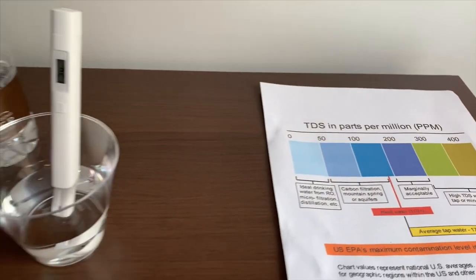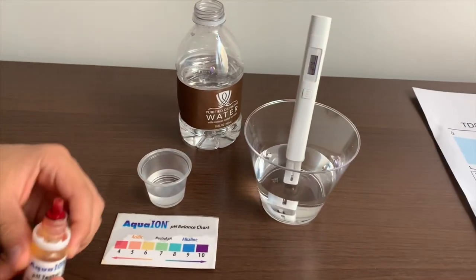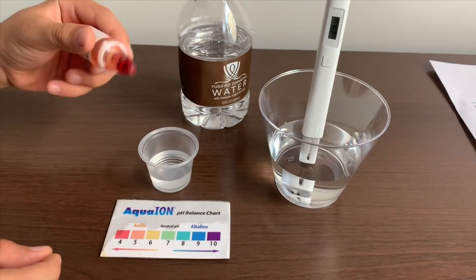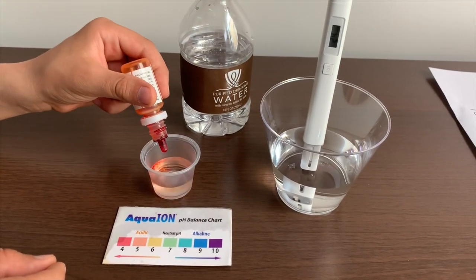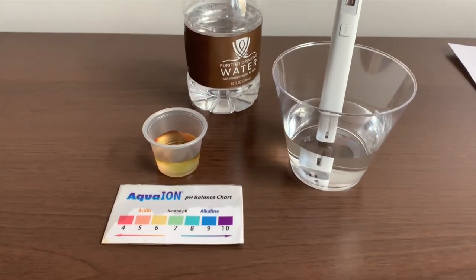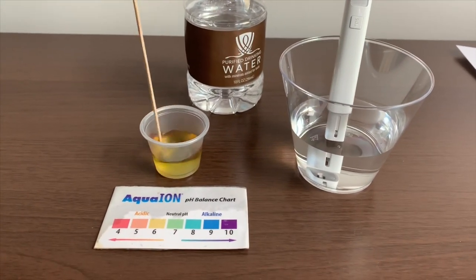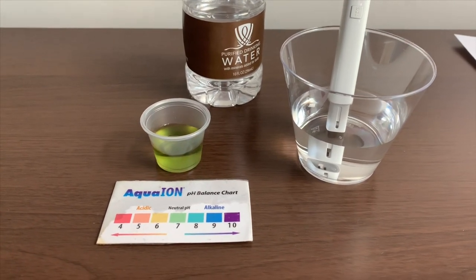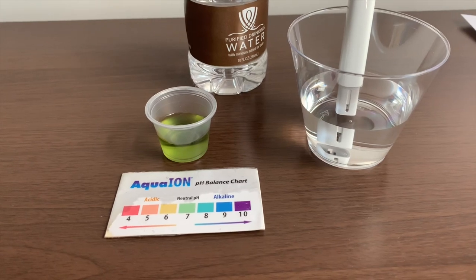Now let's test the pH level. If you want to buy this pH tester, check the link down below. Only do two drops. Let's stir it a little for a better result. I give this a 7.5 — this is neutral pH.